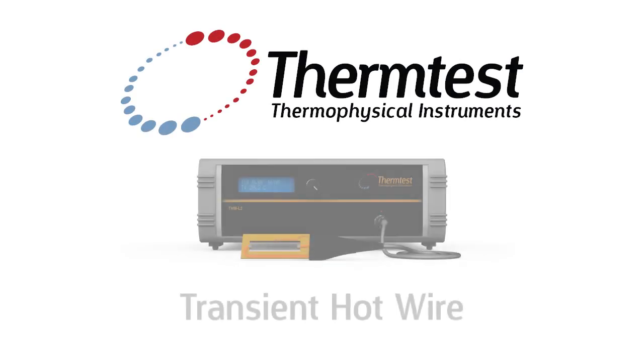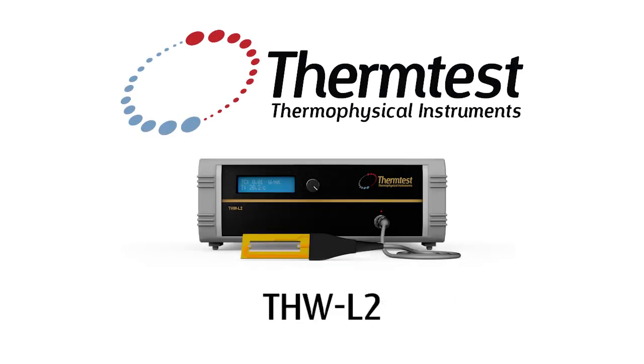Today we'll be doing a demonstration on the transient hot wire, or the THW L2. This follows an ASTM for measuring liquids. In addition, it can measure small particle powders as well as small insulation foams.